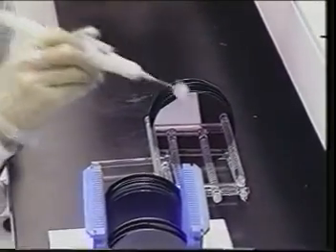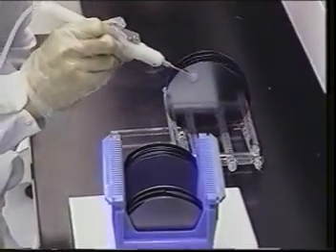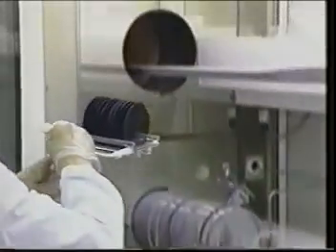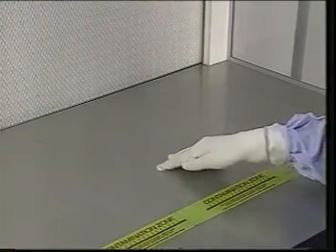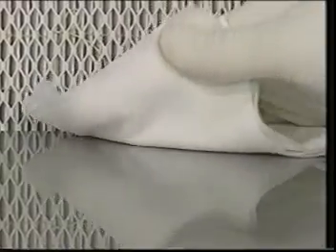When you consider that a single microchip can be composed of 15 to 20 different layers and contain millions of devices at geometries far less than 1/100th the thickness of a single human hair, it's not difficult to see why any contamination, however microscopic, can do serious damage. The wiper is the principal surface cleaning tool for controlling particulates and minimizing contamination in any critical work environment.